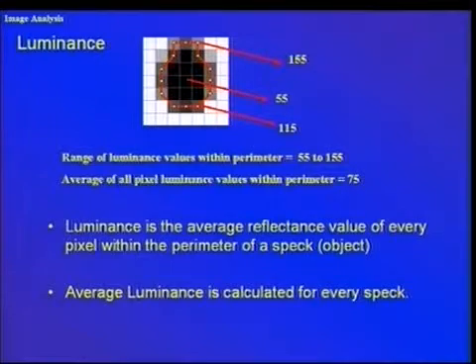Now, TAPPI 563 stresses this in computing the equivalent black area of the speck. In other words, if you have gray specks, they are different from black specks. And it is important to know which you have and how many of each and so forth for TAPPI 563.